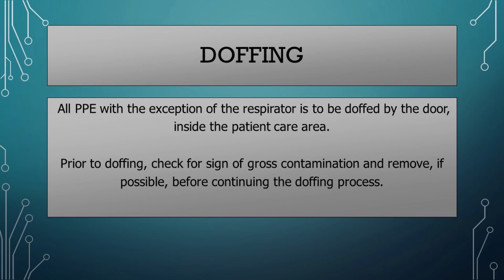All personal protective equipment, with the exception of the respirator, is to be doffed by the door inside the patient care area. Prior to doffing, check for signs of gross contamination and remove, if possible, before continuing the doffing process.